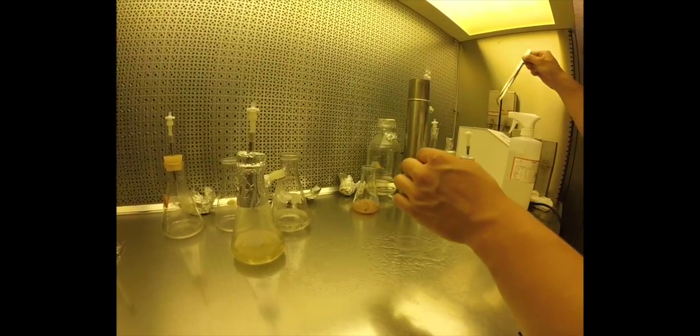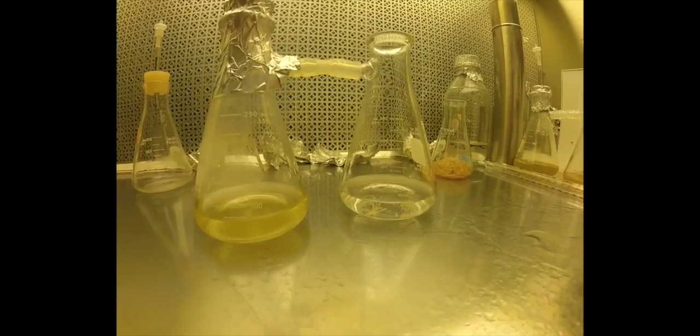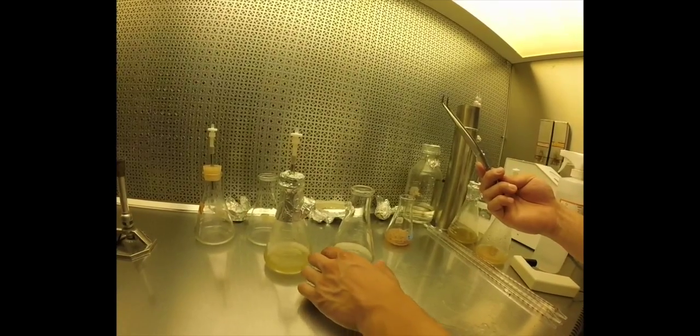So I generally shoot for a good bunch, maybe around 15 to 20 strands of roots when I'm doing an inoculation with this amount of algae. So maybe just a little bit more. That should be okay. So now we can put the sponge plug back into the root flask, put the stopper back onto this co-culture flask, and put them back into the incubator.